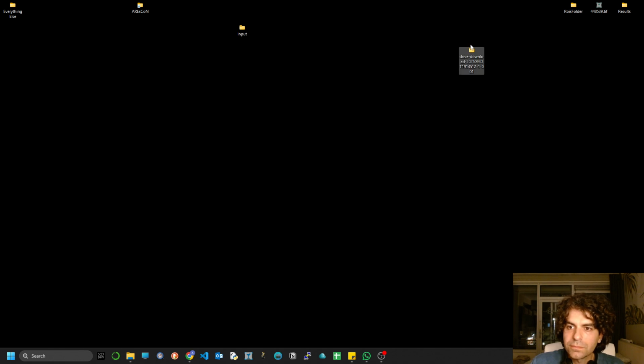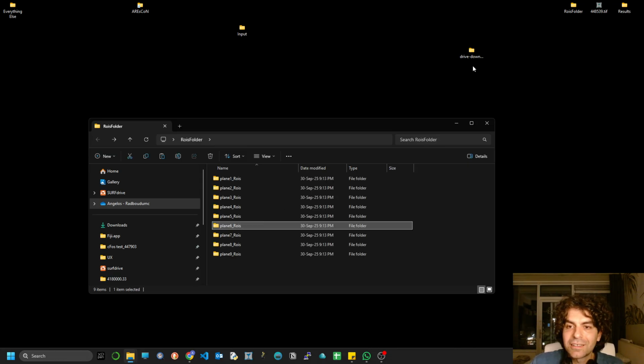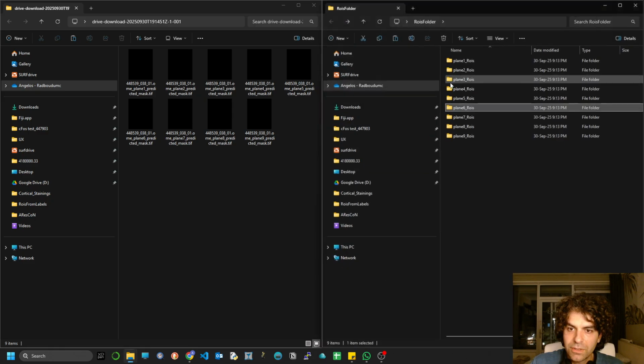Here we are. I've already created a directory with subdirectories inside which contain nothing. Let's just make sure that they do. I think it's fine, okay. And the next step, as I told you, is to split the screen in half. I think this is going to make it a bit easier to paste the images to their respective subdirectory.